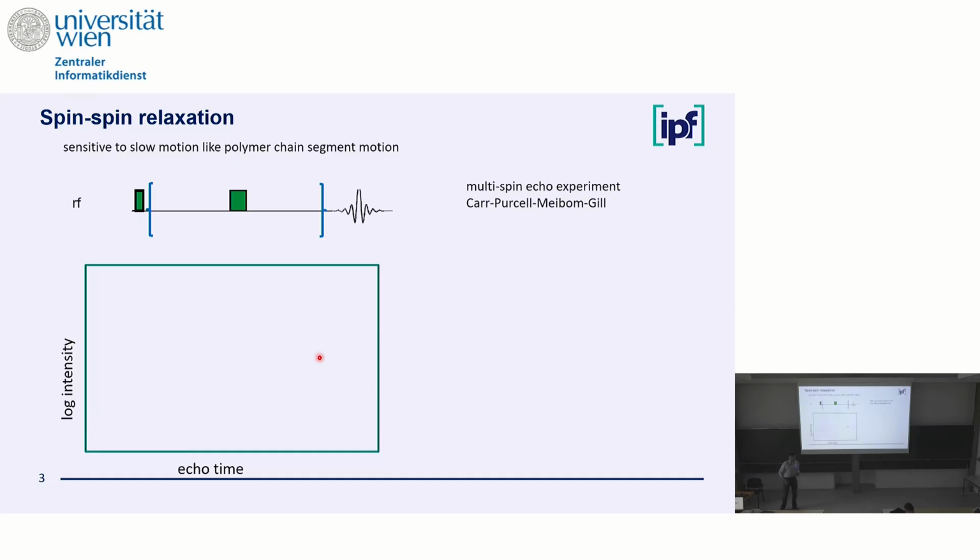The first thing I wanted to insert is a little bit about polymer chain dynamics. Use the transverse relaxation time T2 to learn something about the polymer dynamics. So in general, for most polymers, theoreticians will tell me there's a wide distribution of mobilities, but we can describe what we observe by two modes.